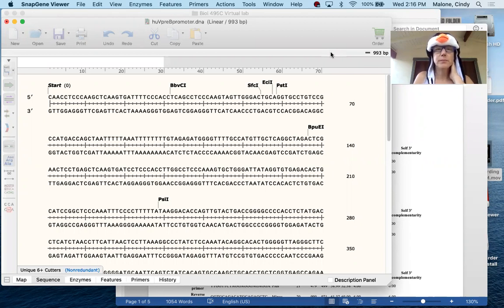So hopefully you have your sequence that we pulled from NCBI, right? Your 5' UTR and a bunch of white stuff. We said about 1,000 base pairs or a little more. So this is my example. Remember, SnapGene shows us both strands, so we just pulled that one strand from the 5' end.